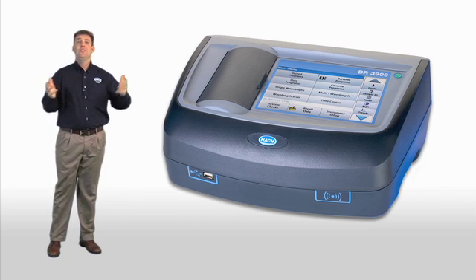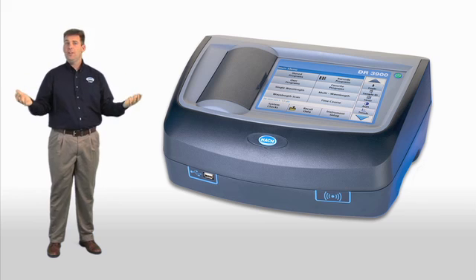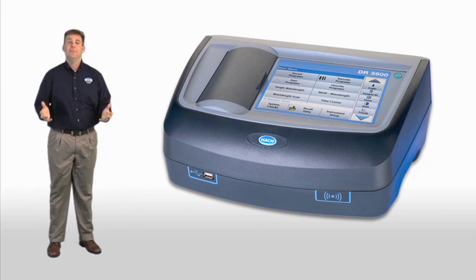That shows you a little overview of what the DR3900 can do, but before we dig into it any further, I'd love to get some feedback from our customers who have been testing this product for us for the past several months.